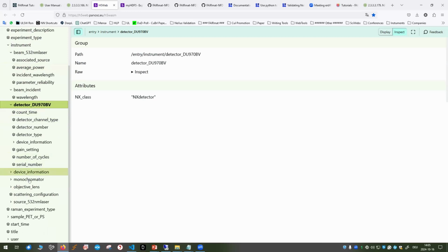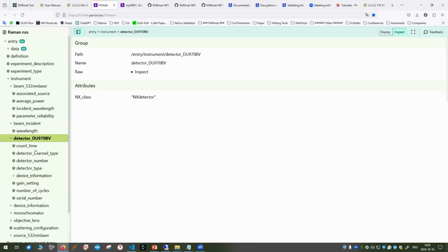The idea is that later you get such a file from a colleague, and in this file everything is contained that you need to know to understand the experiment. There you will see the beam path, all measurements, the integration times, and so on. And this should be enough to understand what this experiment was about and how it was done in detail.